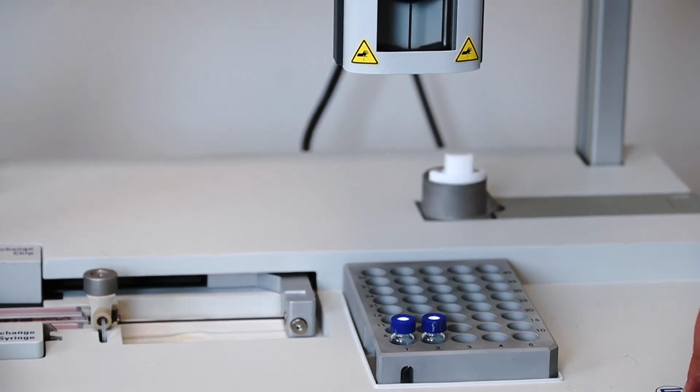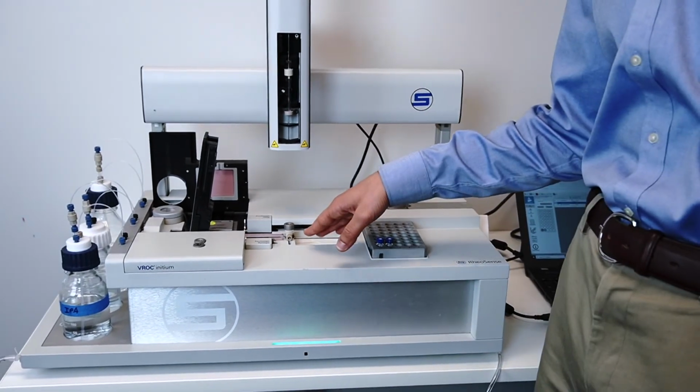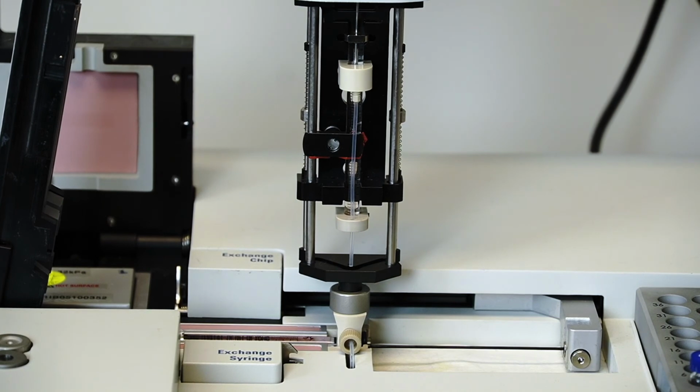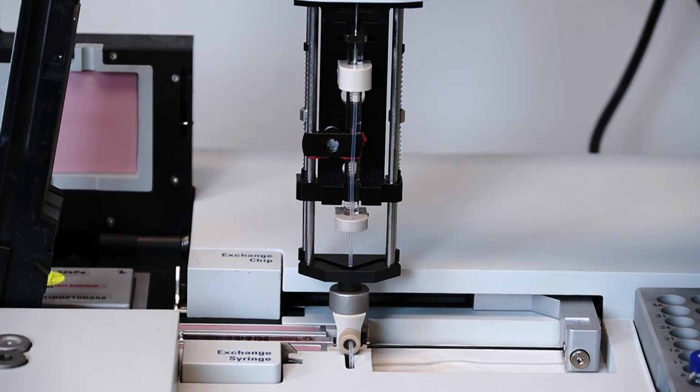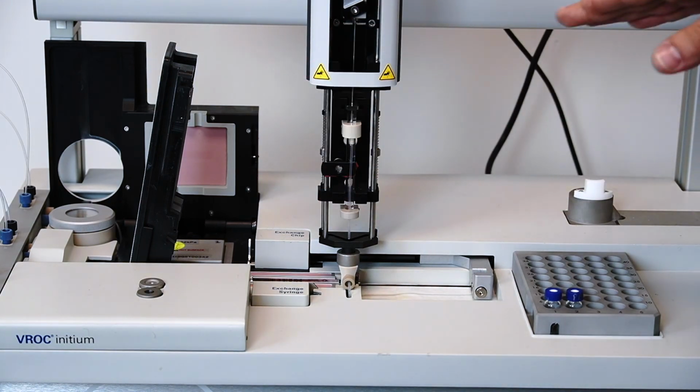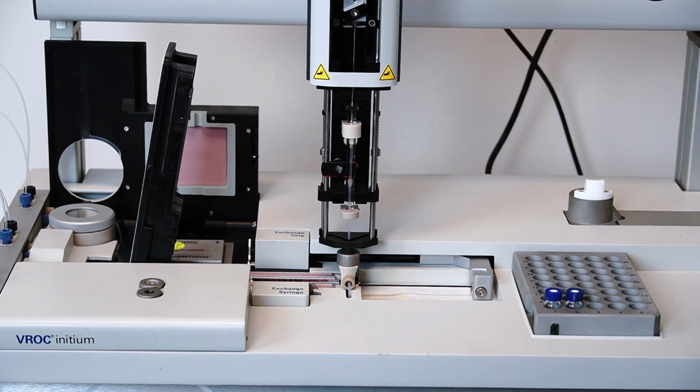Now it's done loading the sample into the auto sampler syringe, and it's now moving into the injection port to load the sample into the test syringe. And again, it is slowly pushing the sample into the test syringe so that bubbles aren't introduced into the closed system of the VROC initium. And normally this would be the point where you could get up and walk away and start doing your other experiments or taking care of paperwork or what have you, since now this instrument is completely running on its own.